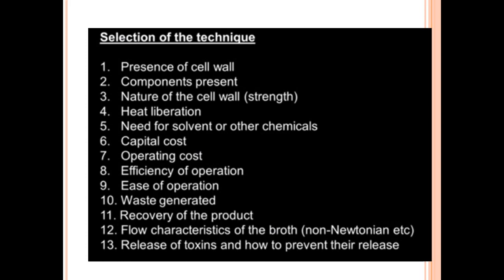Coming to the selection of techniques, when I'm trying to select any mechanical method of cell disruption, these are the bases on which I select which technique to go for. First, whether there is a cell wall and what components are present in the cell wall. That's why in the previous lecture I highlighted various cell wall compositions. Based on that I can decide what kind of treatment might be required.